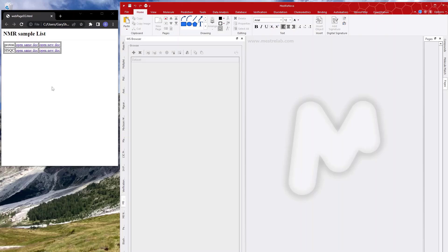Hi, in this video we're going to look at how we can click on a link in a web page and use that to open a file in Mnova.